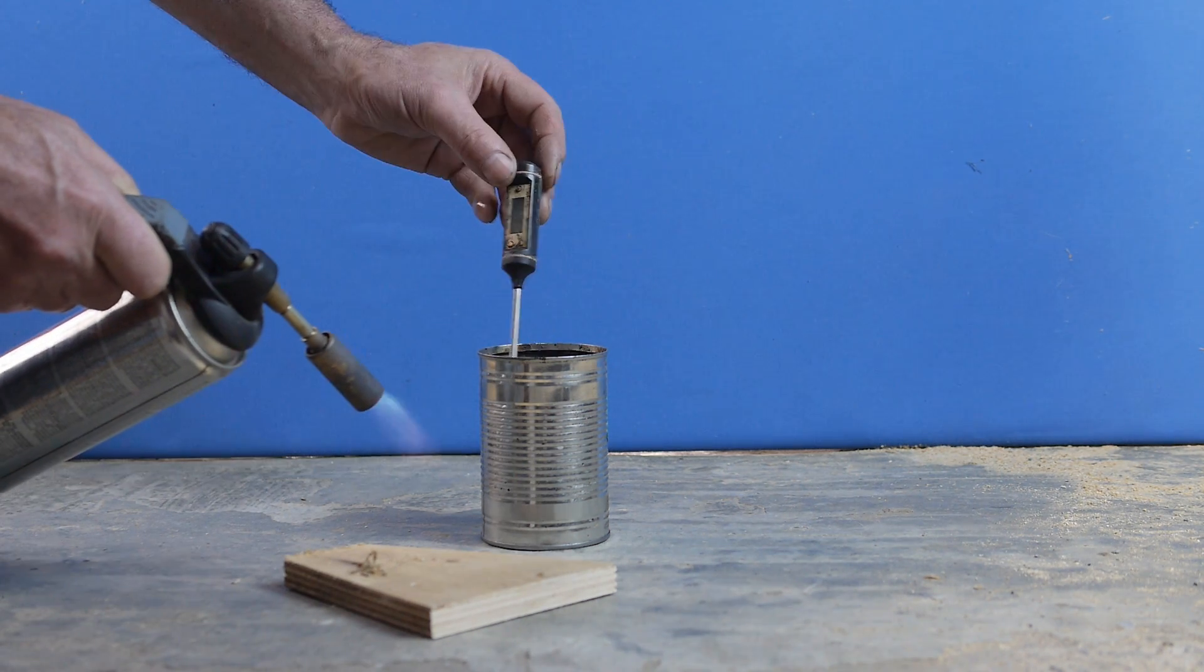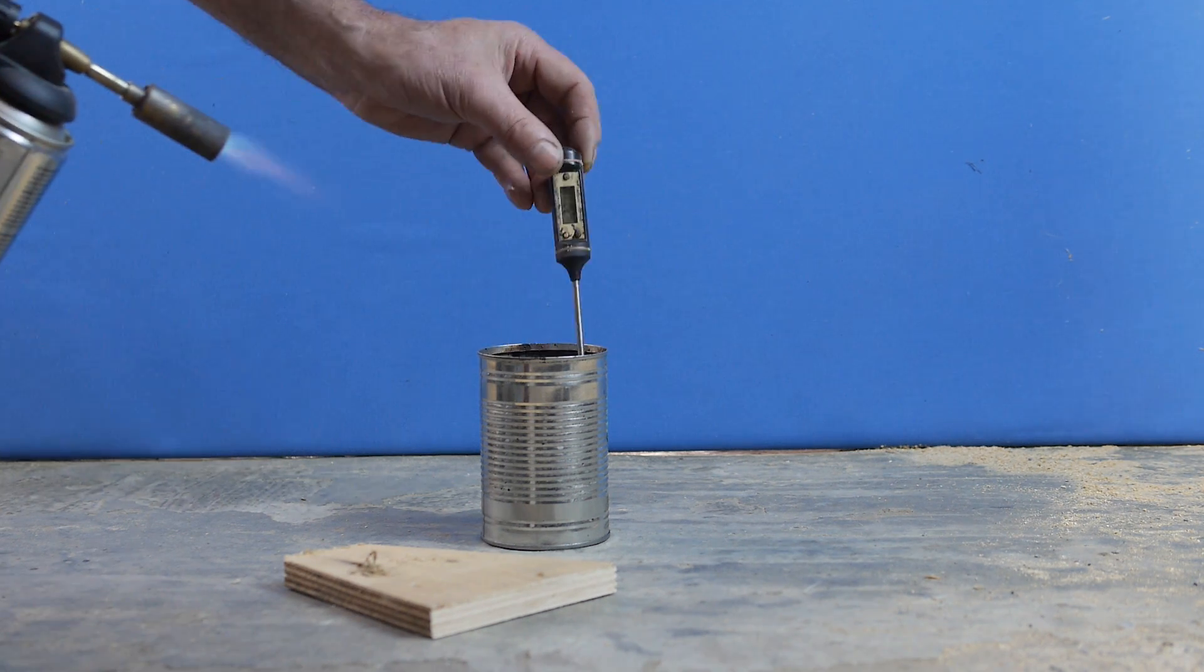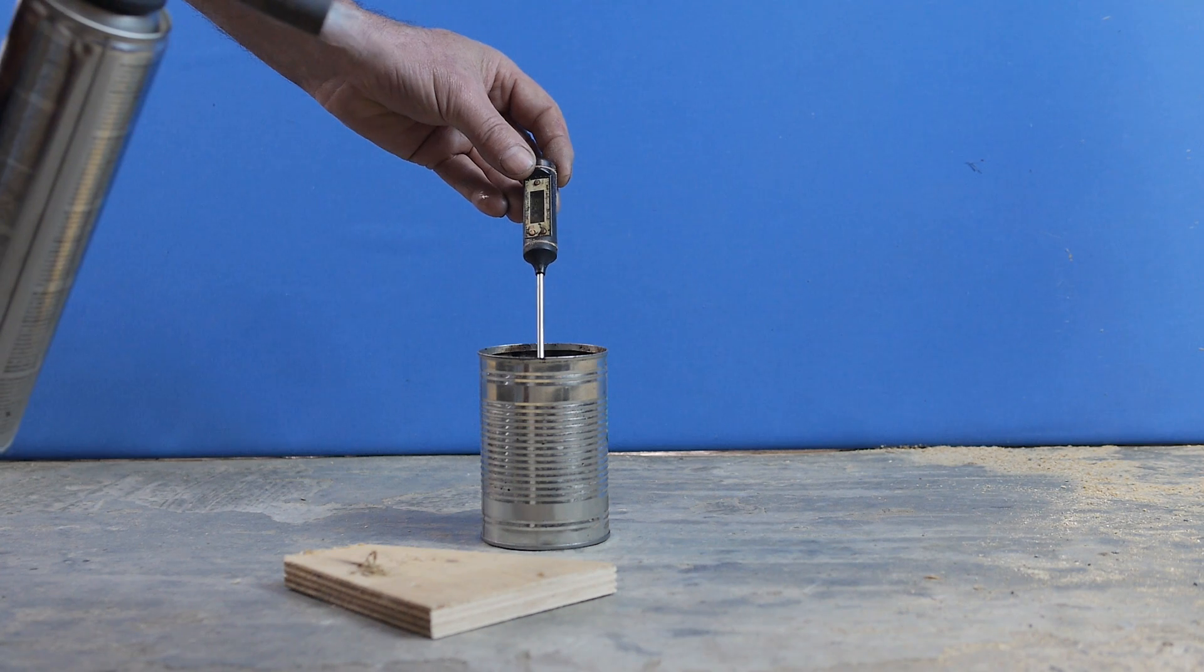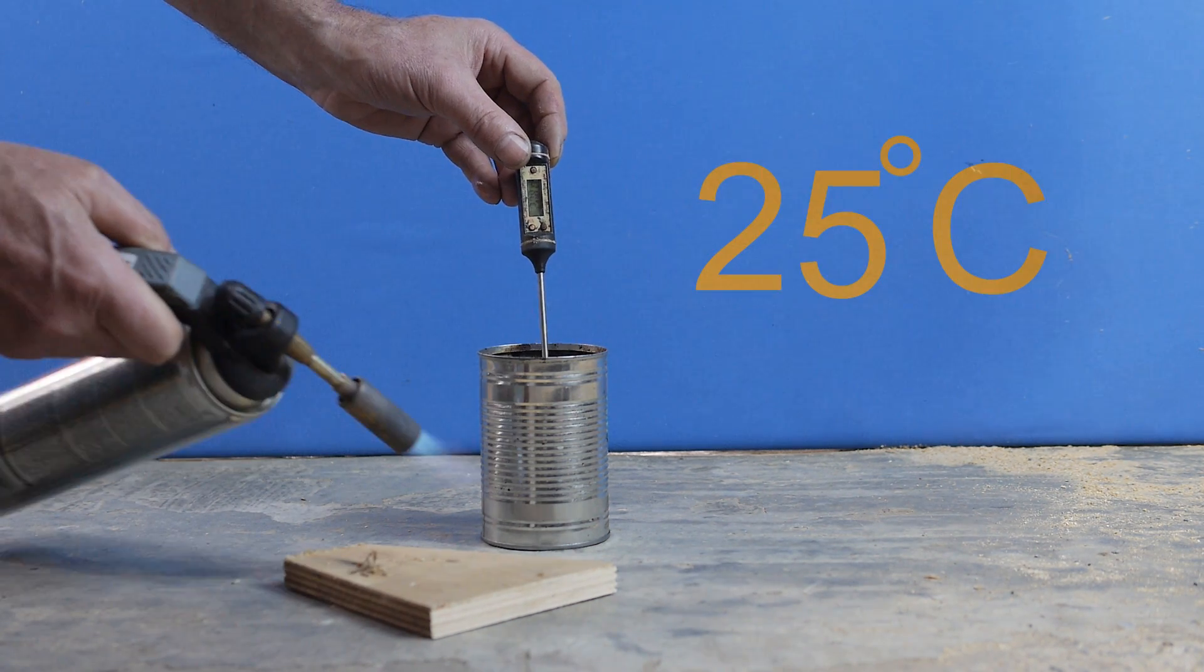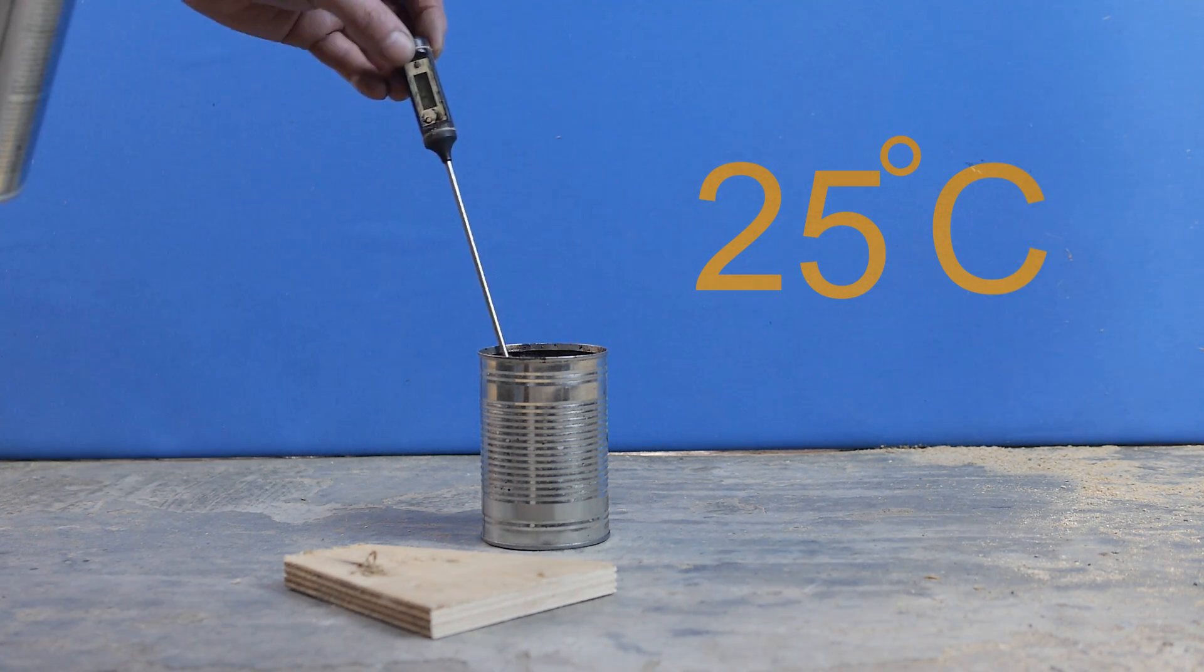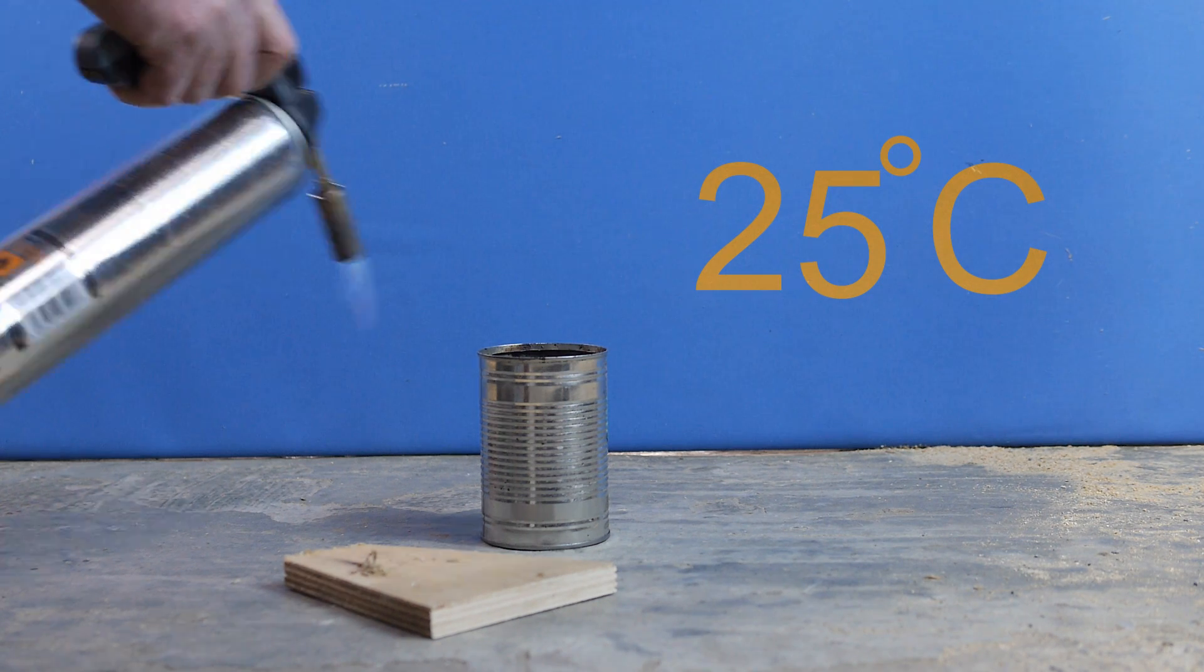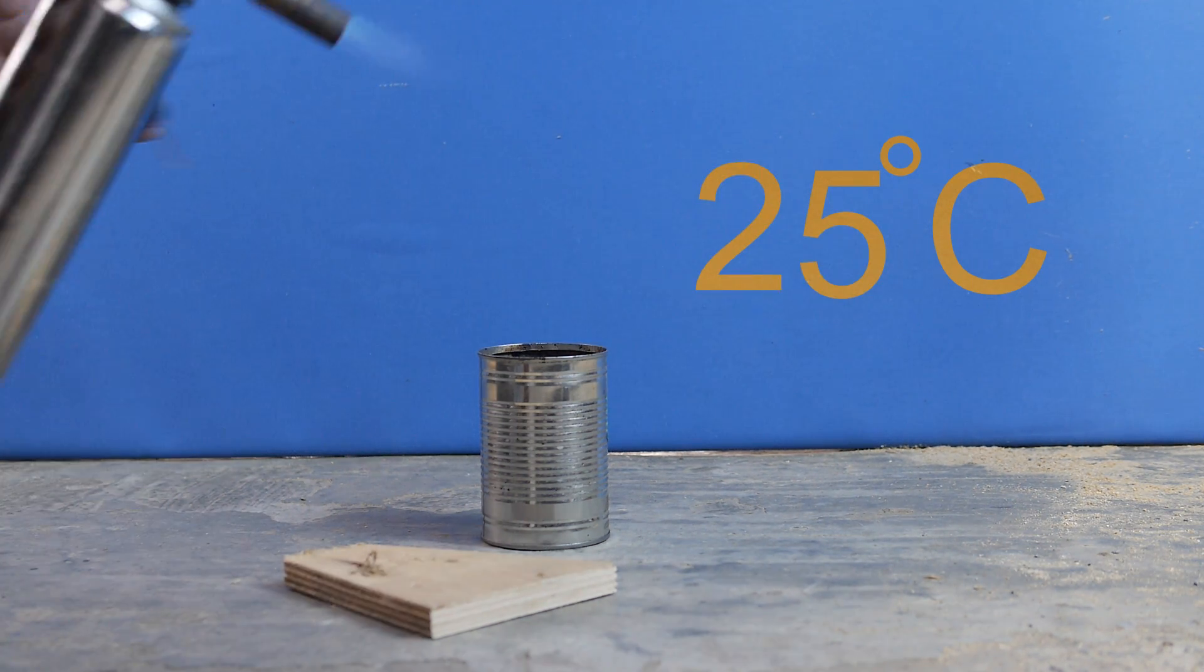So put your thermometer into the fuel and use the gas flame to gently heat the sample up. You want it to rise about five degrees. So you can see we're at 25 degrees centigrade now. Remove the thermometer and again pass the flame over the top of the can. Nothing happened.